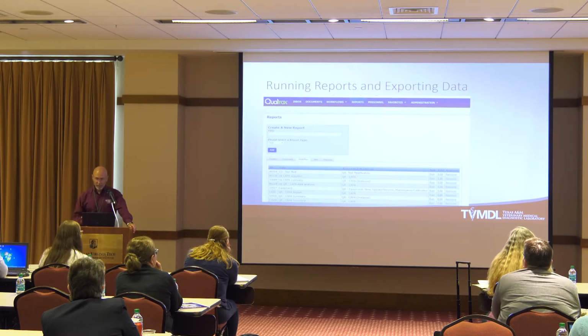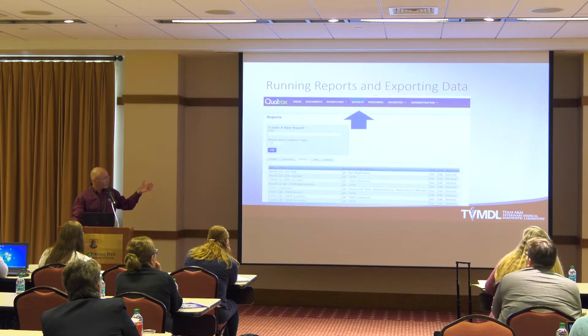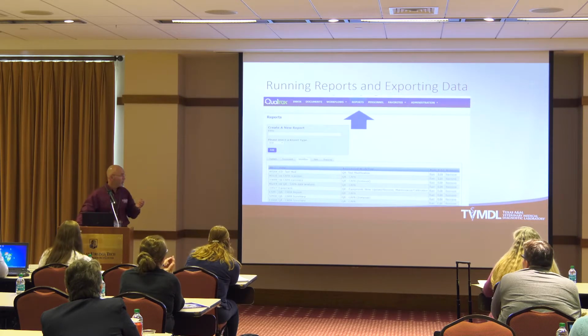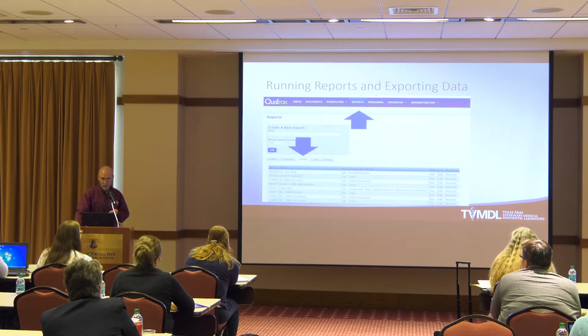Once the report is created, and we're going to run the report, so for those of y'all that might be new, under reports, and our version is an older version of Qualtrax. We're still using the classic view where the menu bar is across the top. So reports up here at the top, then select the workflow that you're going to run on. We have lots of reports that we've created, custom reports. Yeah, all these CWs, those are all mine.